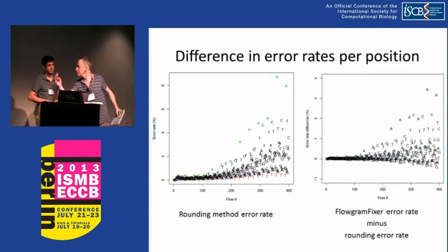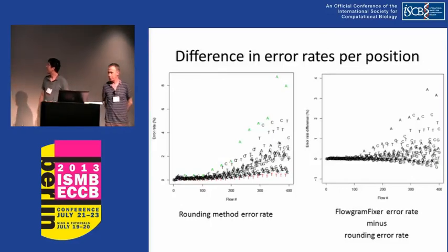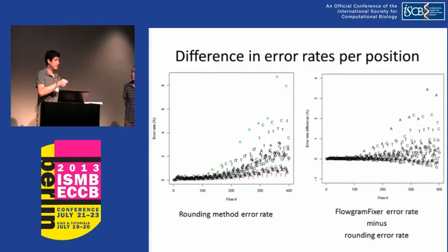I'm just curious if you could expand a little bit on how you intended to correct this drop in error right there? Yeah, it took us quite a while. What we think happens is that you're using a single noise model for the whole chip. Then you have some places where you overestimate the noise and some places where you underestimate. The easier places to call are more affected by these mistakes.